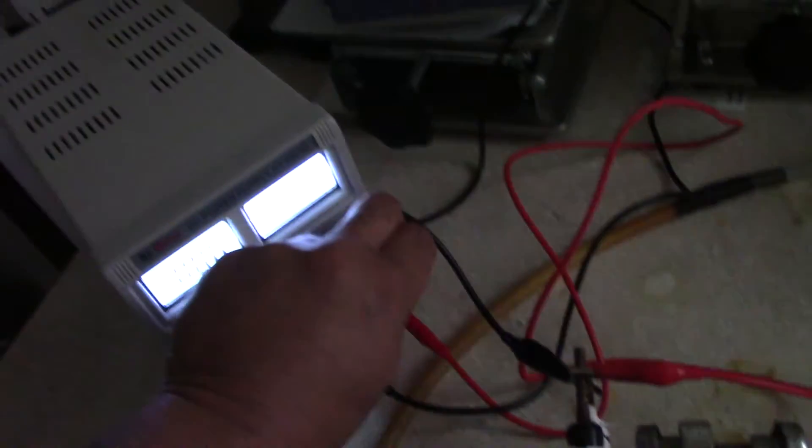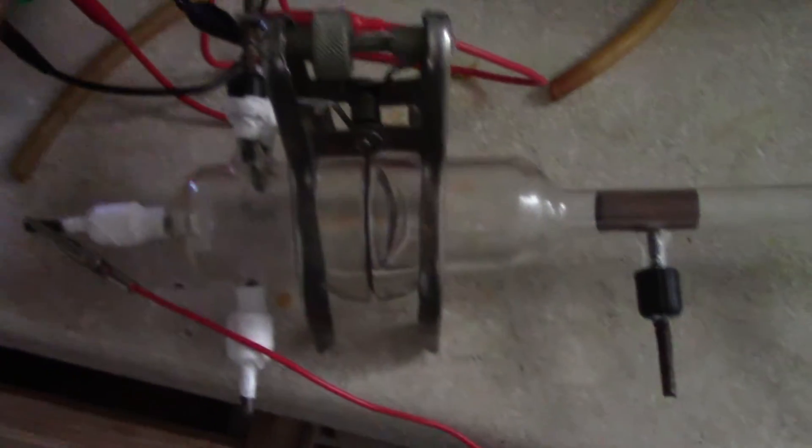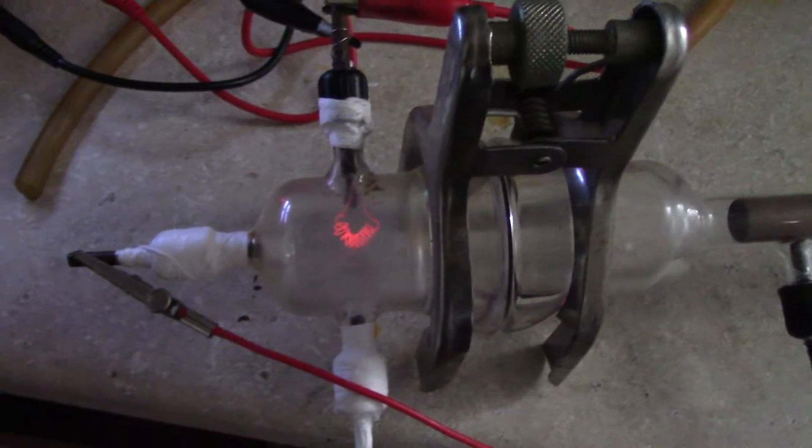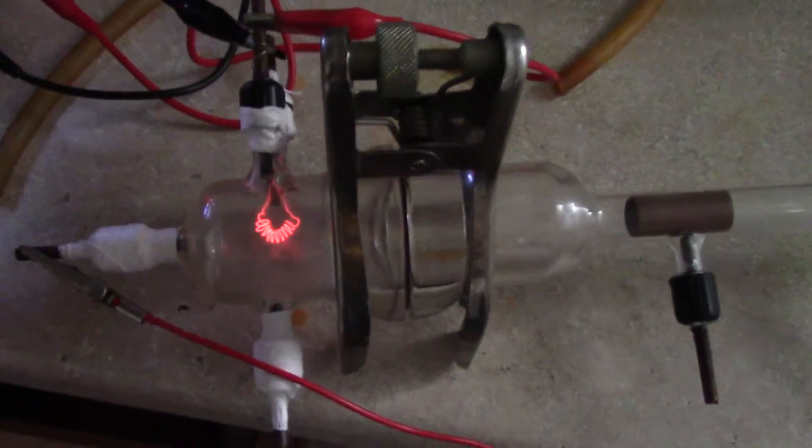So usually set it on about 6-7 volts to start to cast enough electrons that'll go rushing down the tube here.